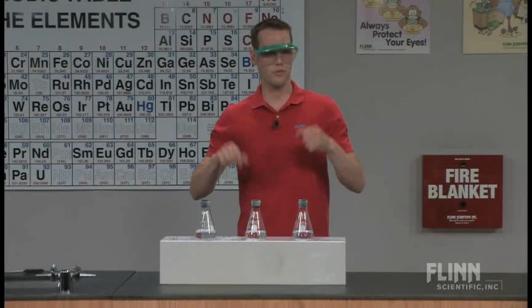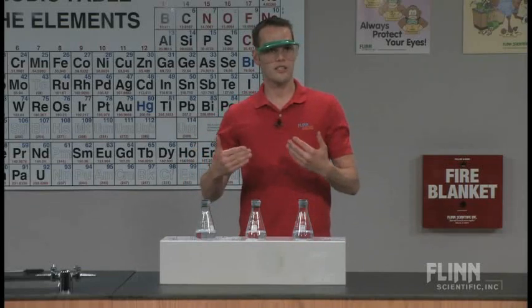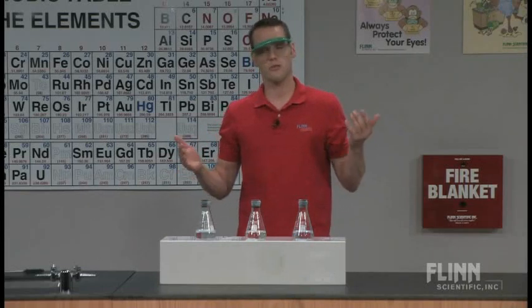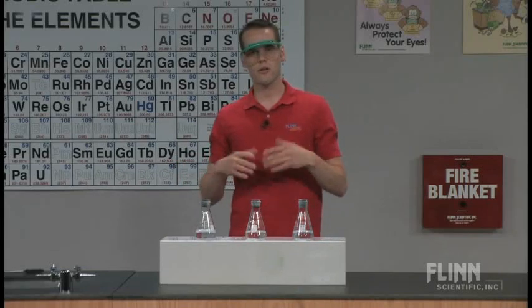And this one can be repeated several times, so if the kids aren't believing you on trials, or you're worried somebody's shaking harder than the other, then you can explain based on what's happening with the amount of shaking, or shake it longer until the students are satisfied that the results are consistent, which is always a good thing for them to do.